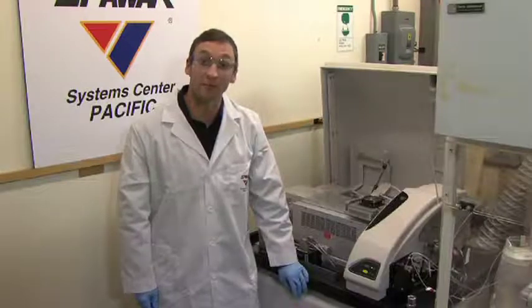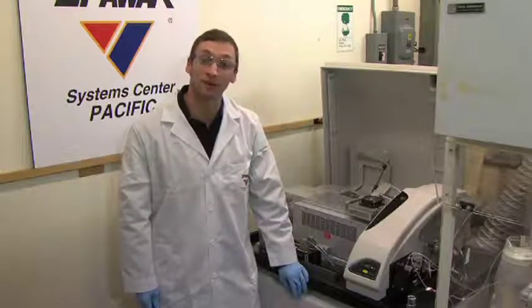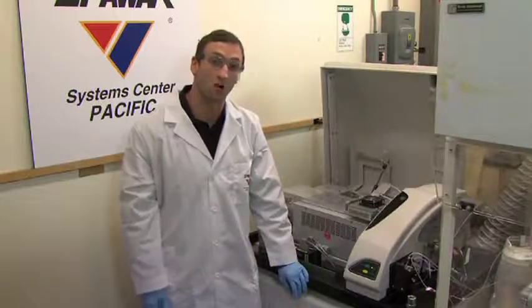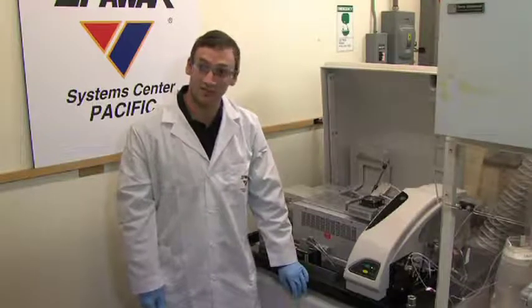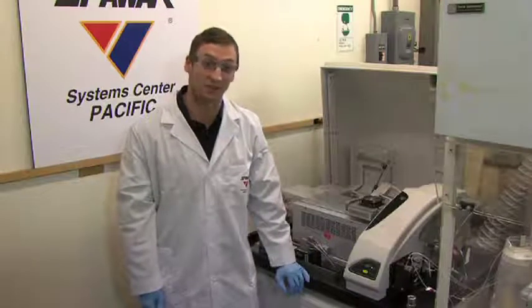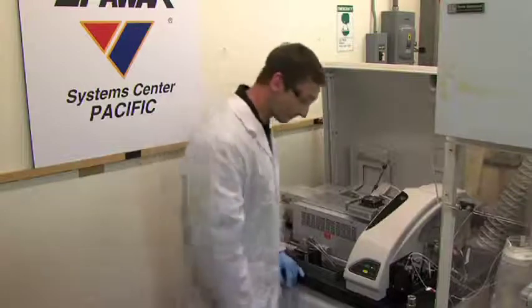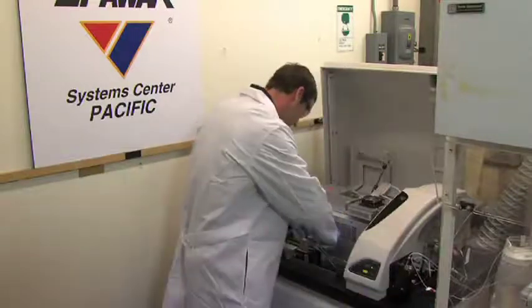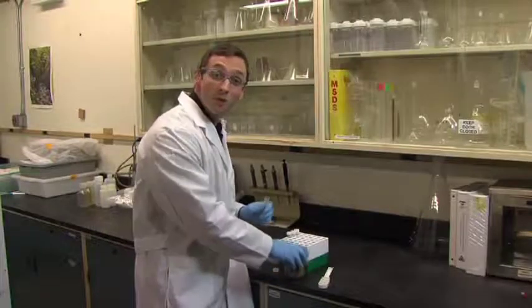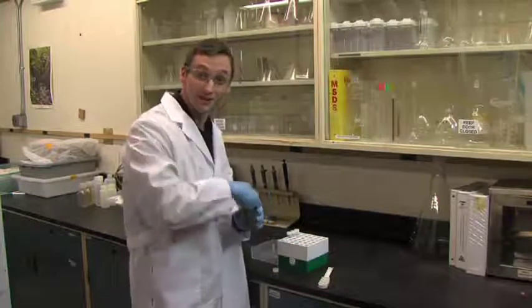Detection limits vary by instrument type, so the project plan should ensure that the technology selected for the analysis can meet the project requirements for the sensitivity. This lab uses the ICP-MS as it has greater sensitivity and lower detection limits. For metal soil samples, 1 gram or less of the sample is used in the analysis.